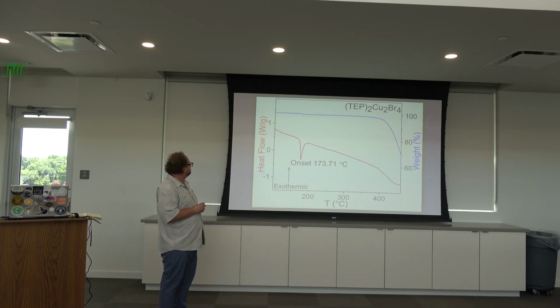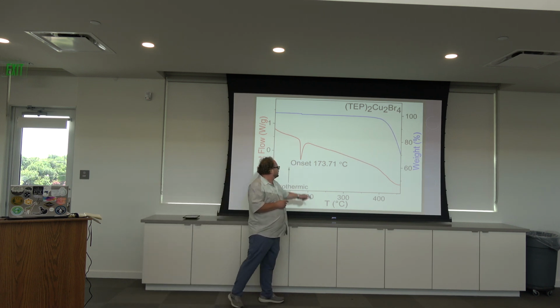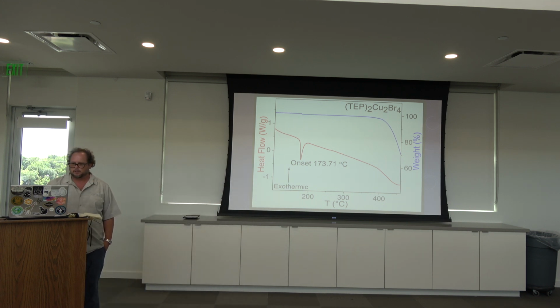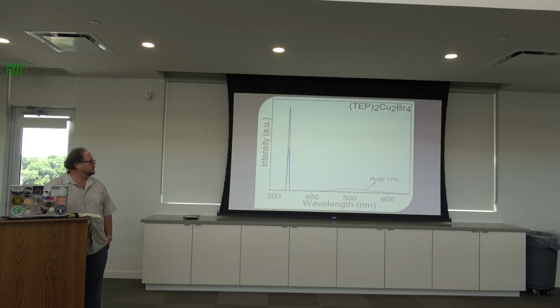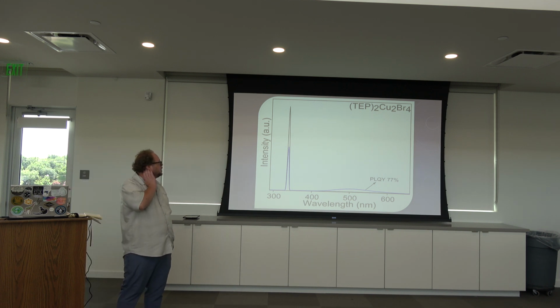So this would be, actually I believe, a melting point here. So another good promising thing that we see with this guy in terms of stability.